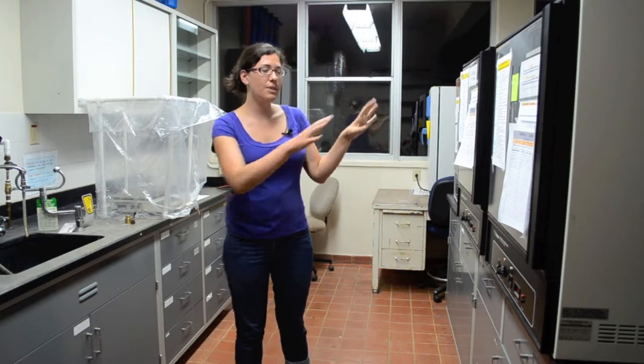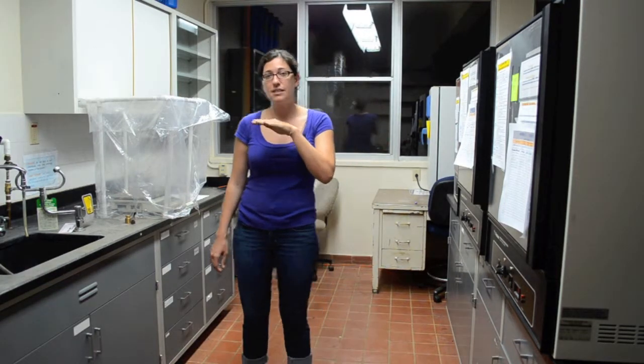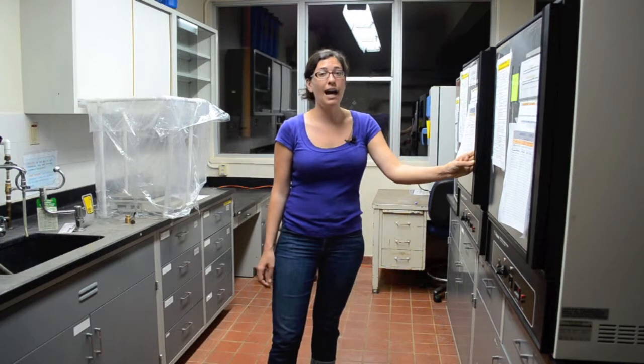The reason we need to dry the samples here is that we need to see exactly what their completely dried weight is at 60 degrees Celsius. If one day it weighs a certain amount and the next day it weighs less, that means it's lost some water weight and wasn't completely dry. If the next day it's the same weight, that means it's completely dry.